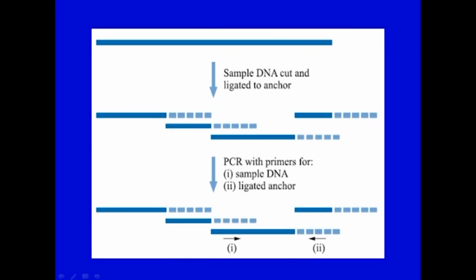There are other forms, like emulsion PCR. In this technique all the reagents are incorporated inside lipid droplets and PCR is carried out on a much smaller scale. An advantage is that it is possible to increase and decrease the temperature of small droplets very quickly. If each droplet contains a single template molecule at the start, then all the products in an individual droplet result from the amplification of a single template molecule. This is also called droplet PCR.